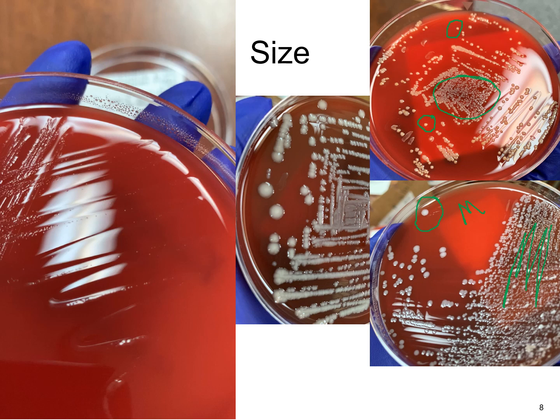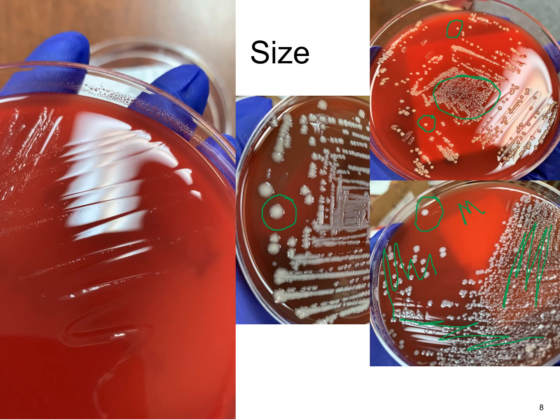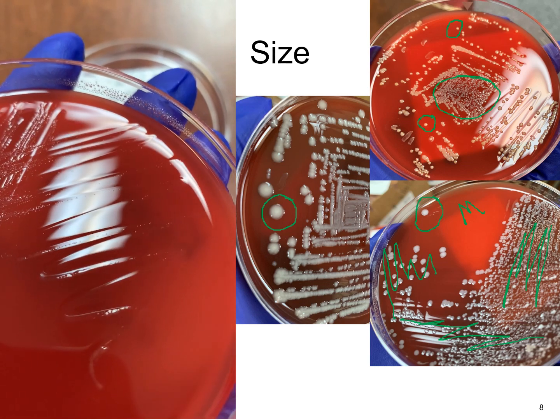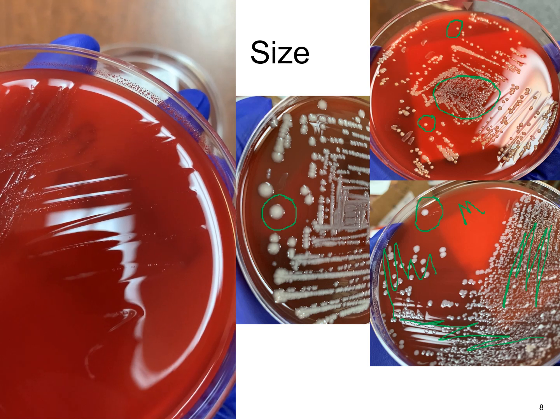And then it streaks out, and then you have another streak. I can't quite tell if this is a 3 or 4 quadrant streak. Then your next plate here, you have some large colonies. And if you look at the video to the side, you can barely see those colonies, so you really have to tilt the plate to see them, but those are pinpoint.